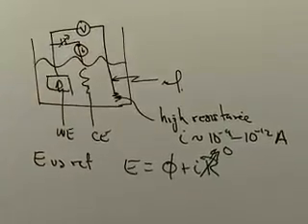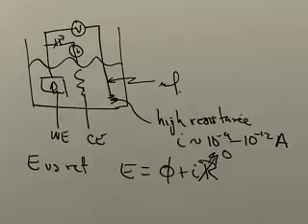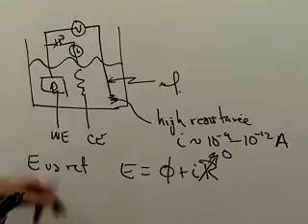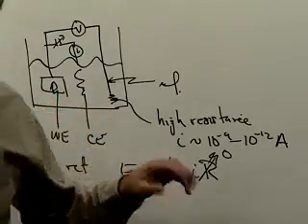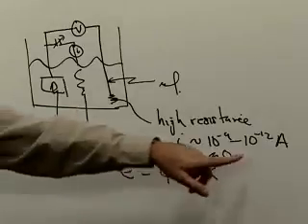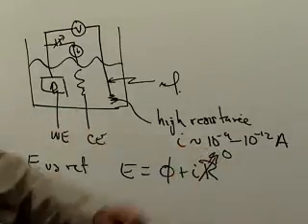But if you have a high resistance, you have a low current. Right, so I times R is a small number. By a high resistance, I might put a megaohm. That would be a high resistance, a megaohm of resistance, say, between these two electrodes. I probably don't even have that much to have it high. A megaohm is definitely high. But still, if I'm only passing a picoamp, I times R is still a small number.